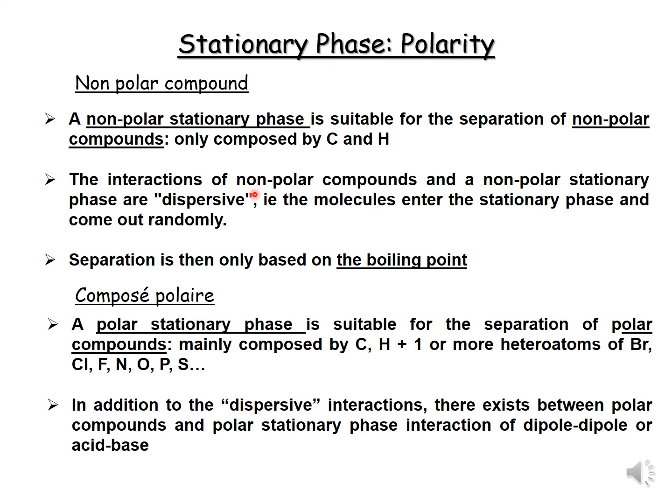The interaction of non-polar compounds and a non-polar stationary phase is dispersive. Here, the molecule enters the stationary phase and comes out randomly. The separation is then based on the boiling point.